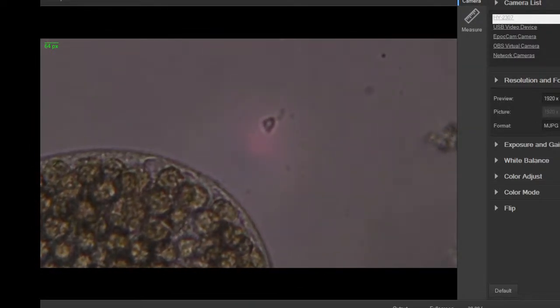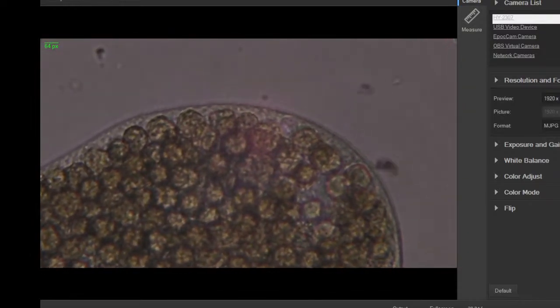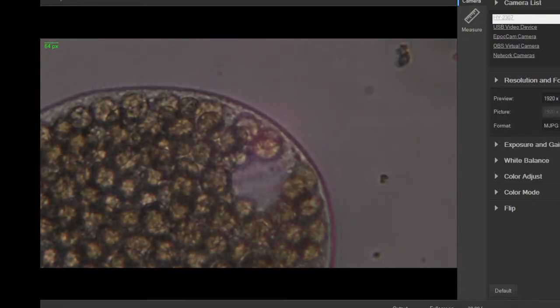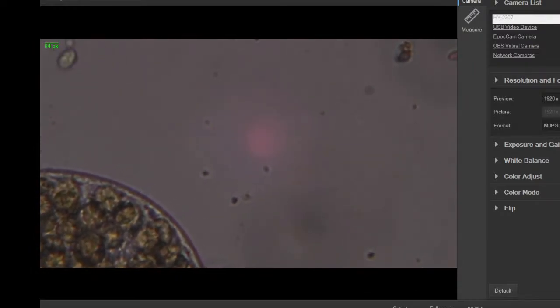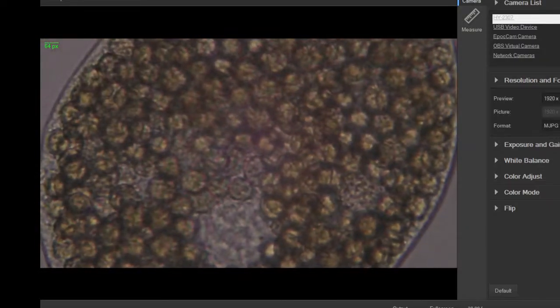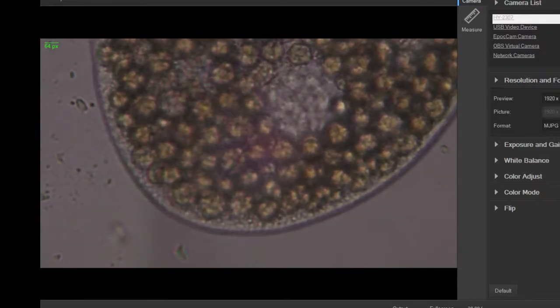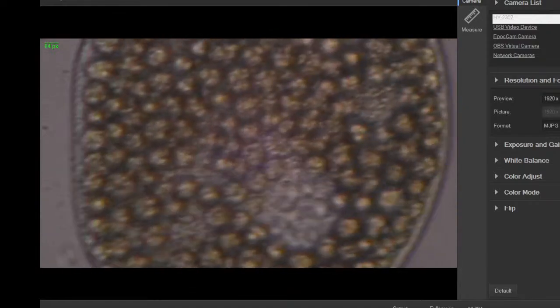It's hard to do this with only a couple hands here, but using the cursor, this area right here, you'll see it expand and contract. Here it goes. Keeping that water balance. This other white section here is not doing that. So it's either a contractile vacuole that's not currently working, or it could actually be part of the nucleus. It's hard to tell from this angle.